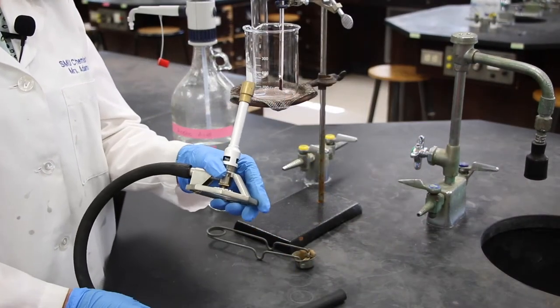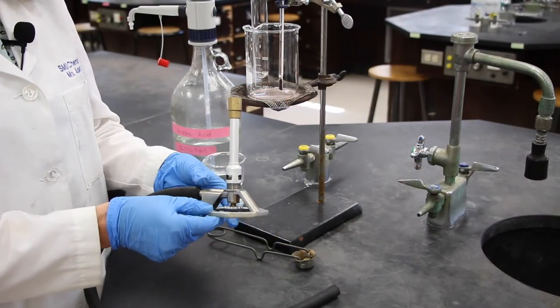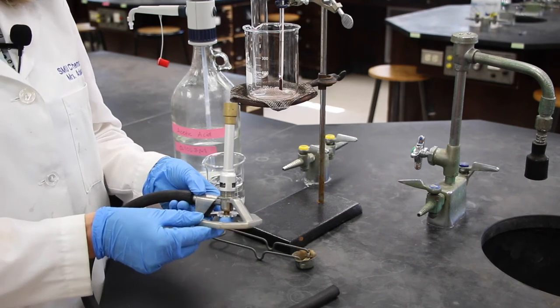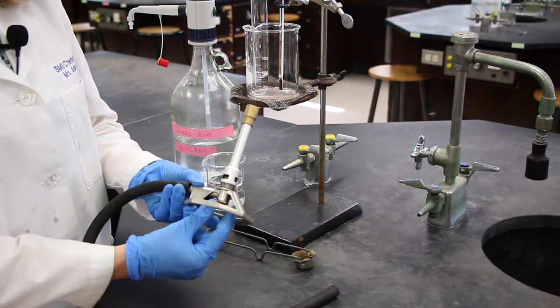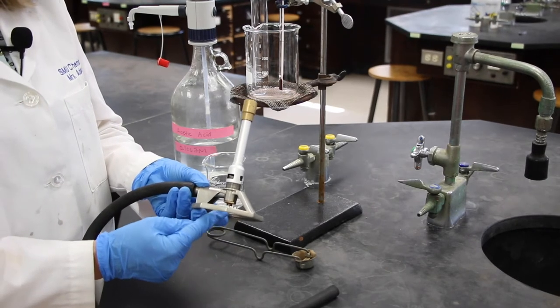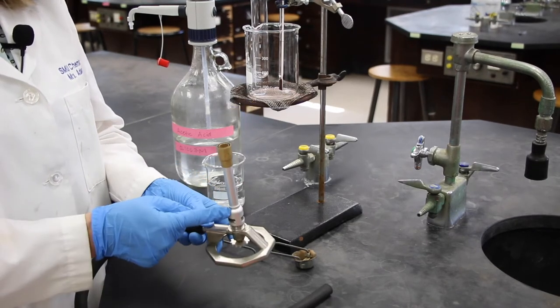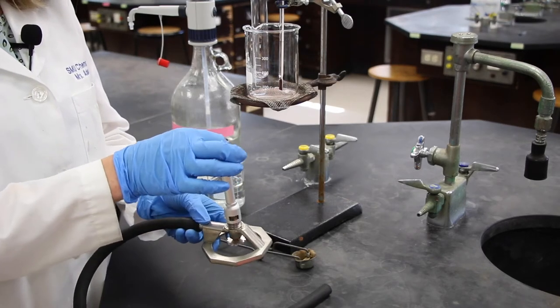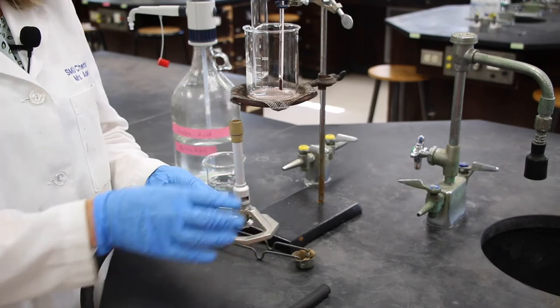The next piece of equipment that we'll use is the Bunsen burner. There are two parts to the Bunsen burner. There is the gas flow, and that is controlled by the knob at the bottom. And there is the air flow, and that is controlled by turning the barrel of the Bunsen burner.